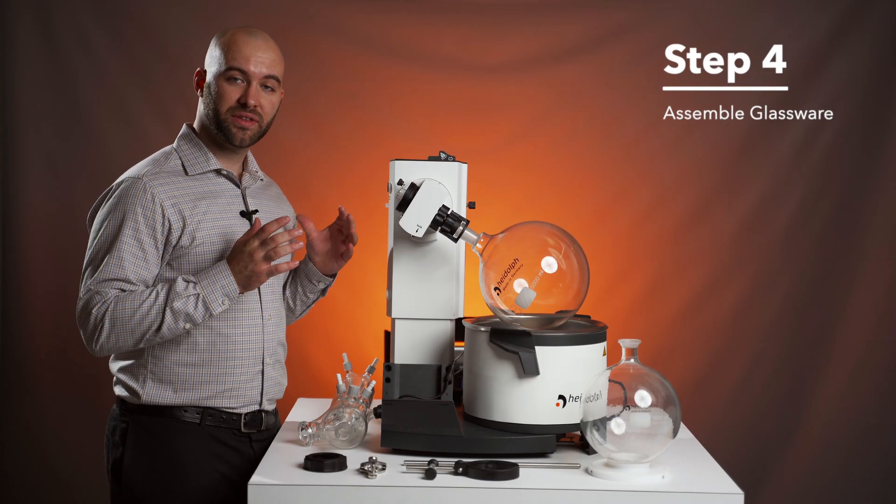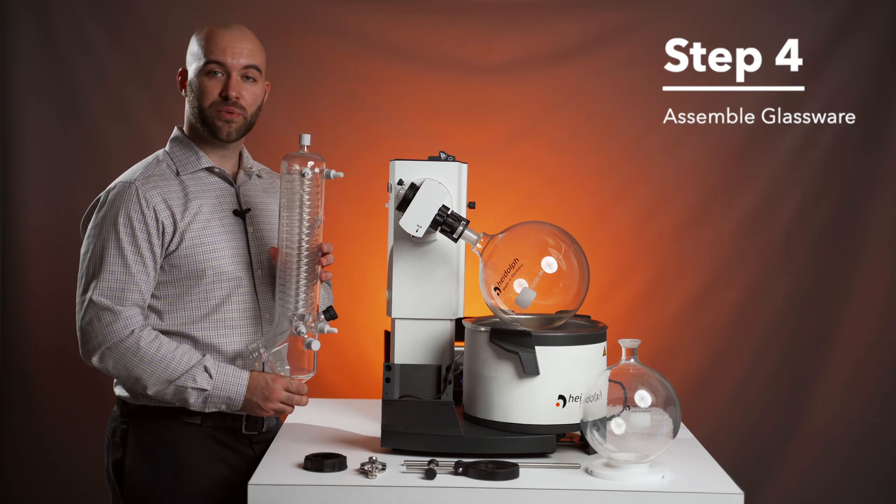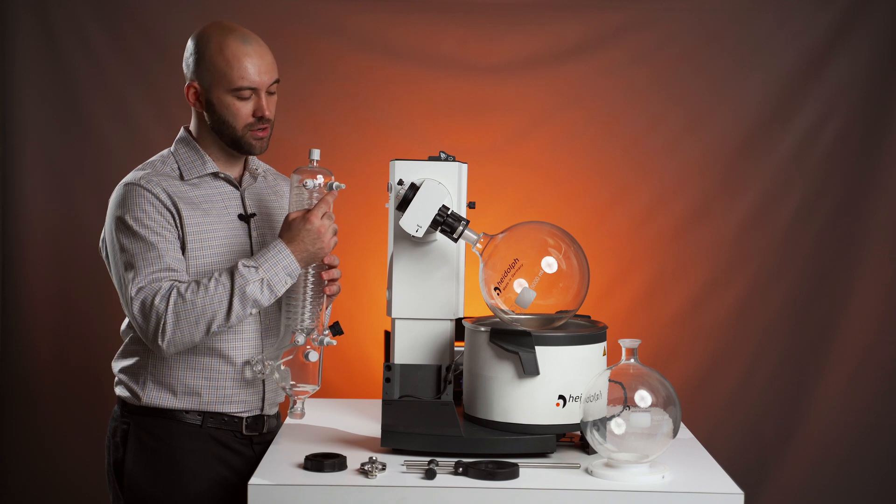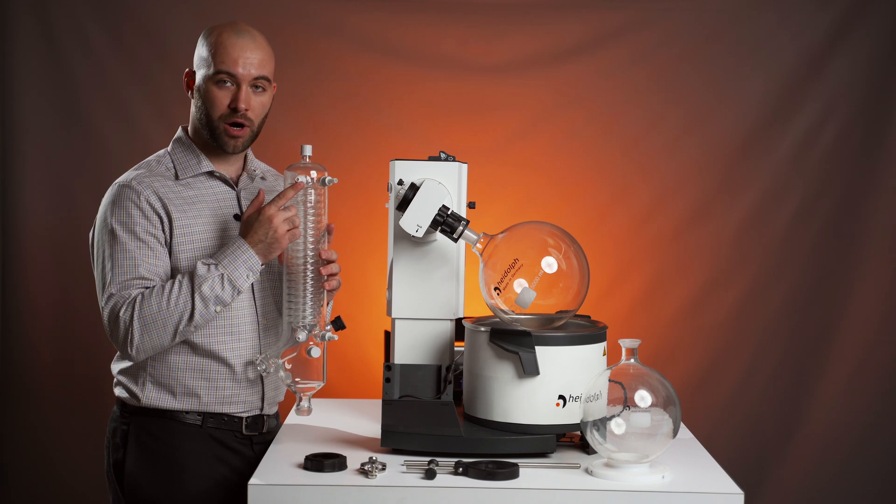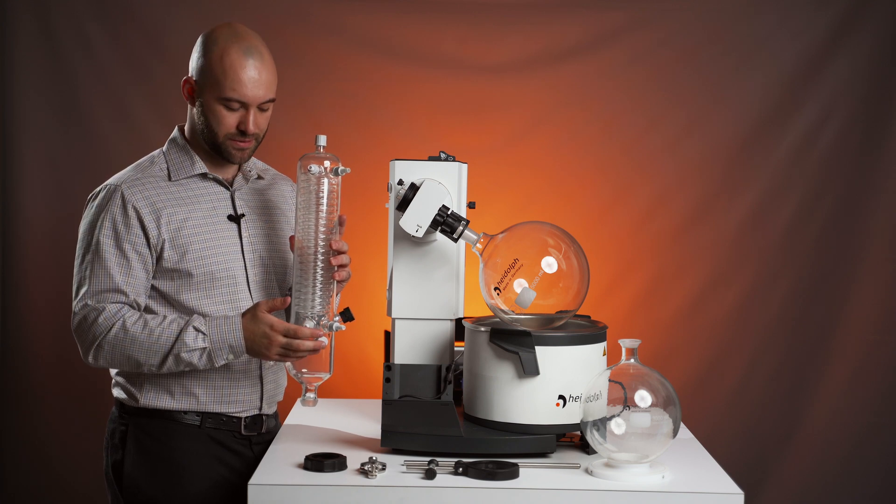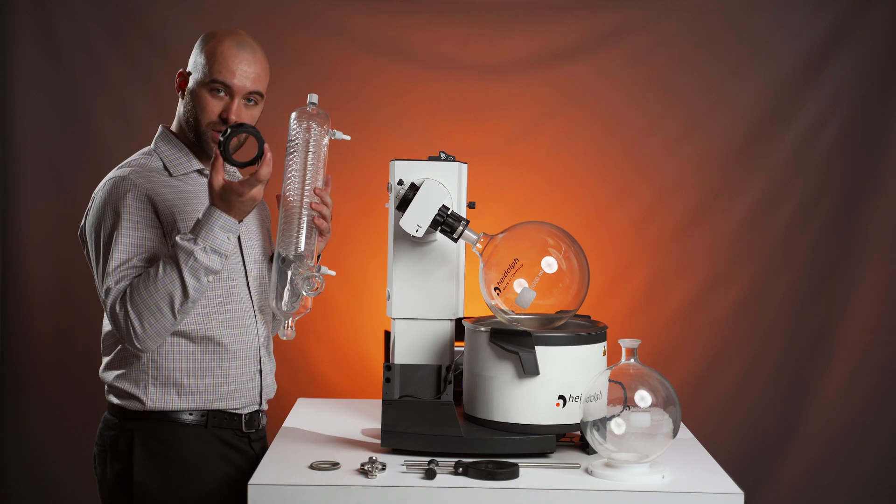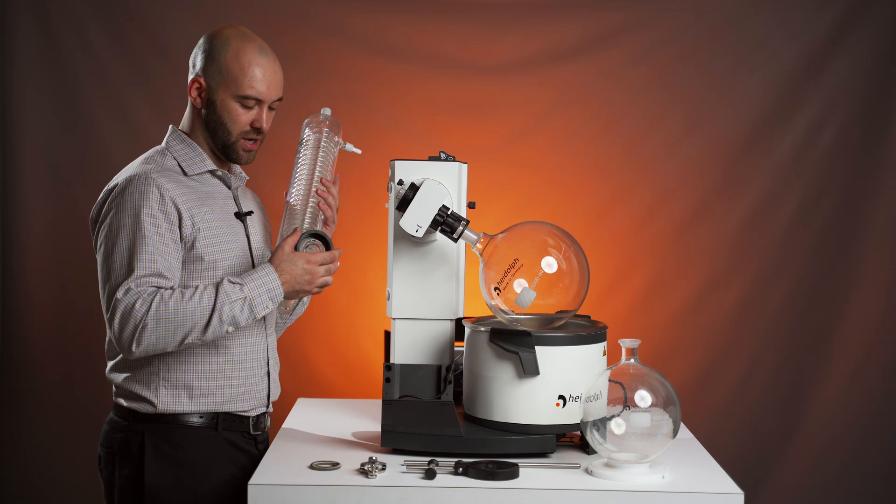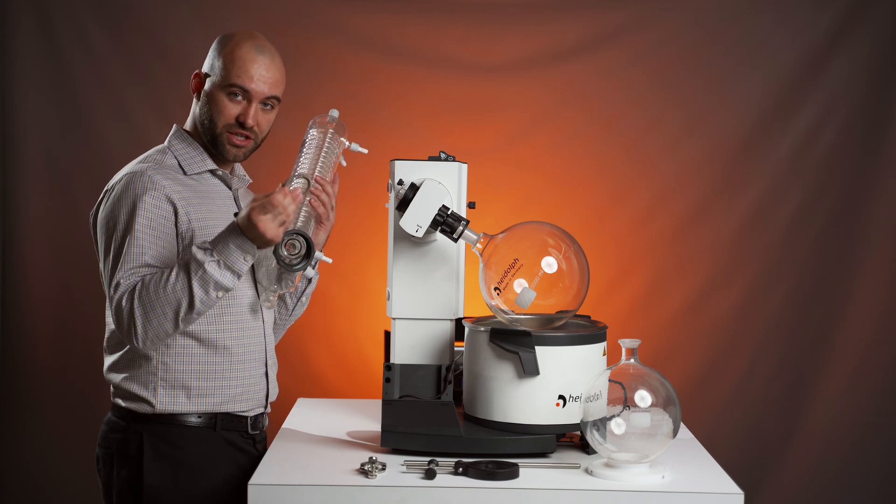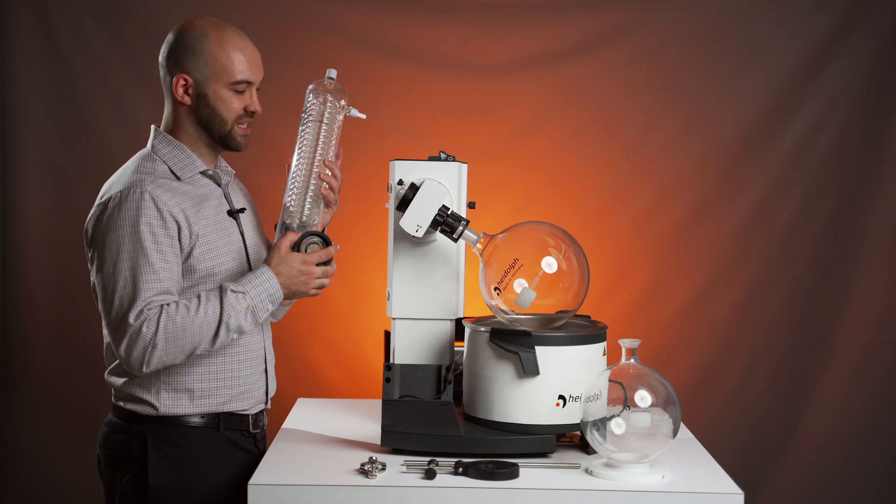Step four, we will be assembling the glassware on our HiVap. We will start with our G3 XL condenser. From the box, you're going to want to make sure you have attached four GL-14s with barbed connectors and two GL-18 caps. Once that is done, you will take that screwing clamp that we removed in the last step and slide it over this connection. Following that, the tension spring that was included will go around to prevent it from sliding off.